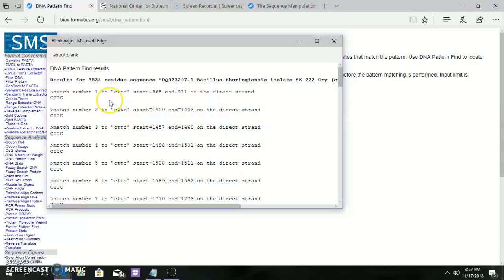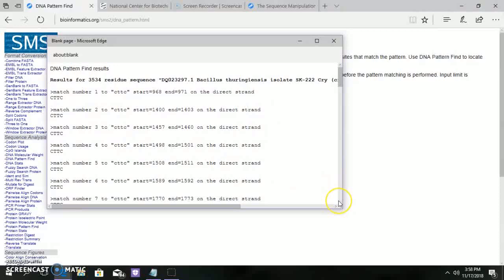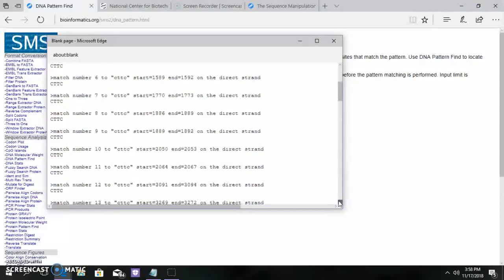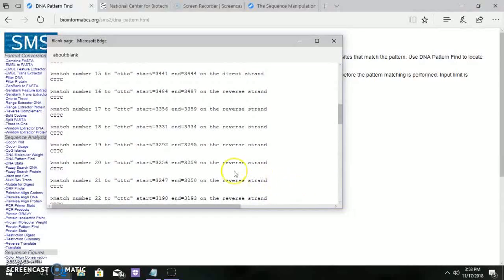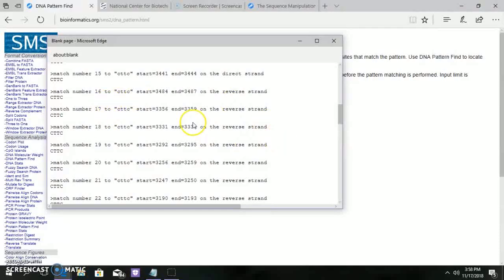Here for match 1, 2, 3 and most of the matches, the strand is the direct strand, and for match number 16, the strand's position is the reverse strand.